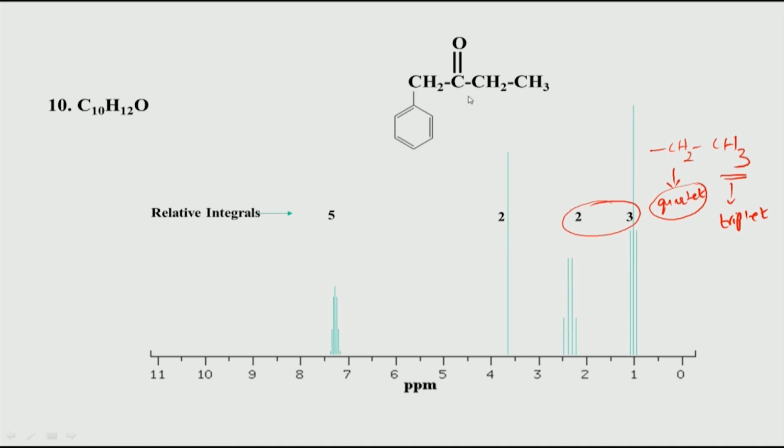Now, one thing is, if we had a carbon spectrum with us, we would have looked at the carbonyl peak in the NMR spectrum, and that gives you a very nice peak at around 170 to 200 ppm, depending on the functional group. So, there is a wide range of distribution, depending on whether it is an ester group, a ketone group, a carboxylate group, an aldehyde, and so on. Based on that, the carbonyl frequency is very specific, and we can use that.